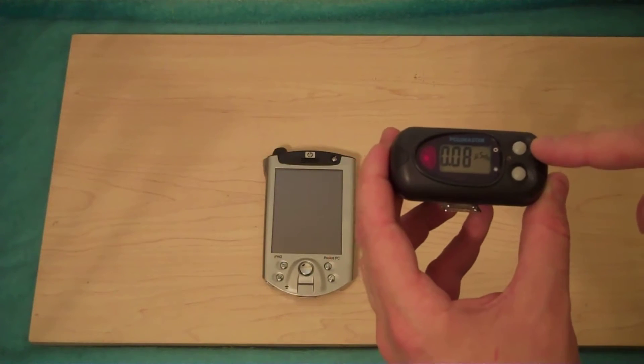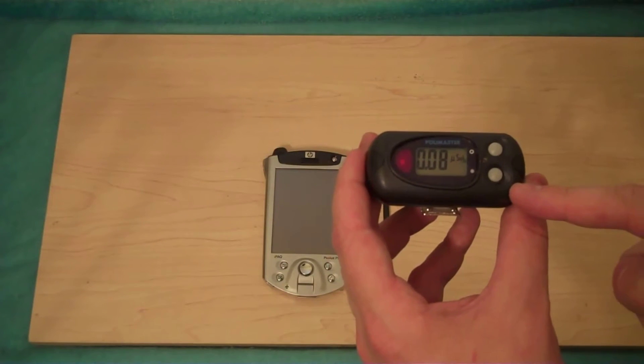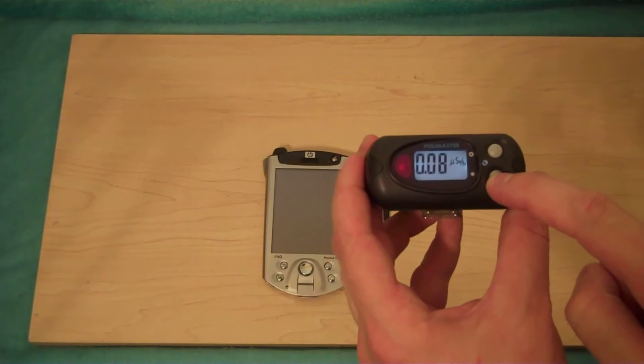That's the mode button, switching between its functions. Below is the light button. If you hit the light button, it turns the light on. If you hold it down, it'll tell you how much battery power you have left, which is useful.